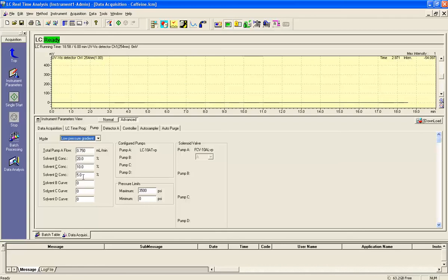This data will be given on the lab practical for that day. You will go in, these will already be determined. You just need to demonstrate that you know where those settings are going to go, and that's where you will key those in. Okay. Over here to the center of the screen it says configured pumps.